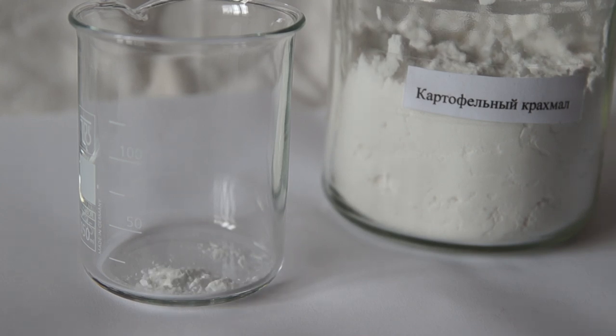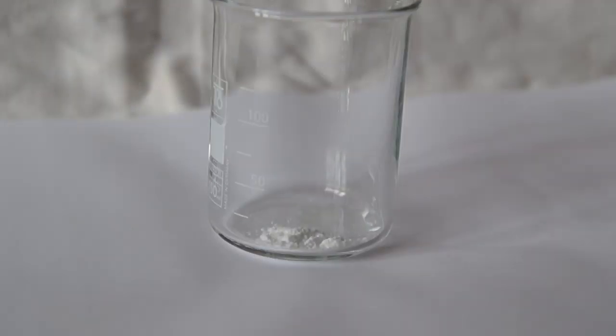Now we need to prepare the starch solution. To do this take a glass and add a little potato starch there. Fill it with cold water and stir it to dissolve the starch.